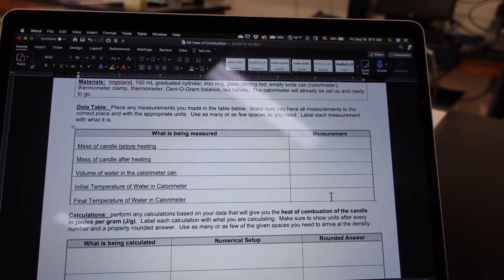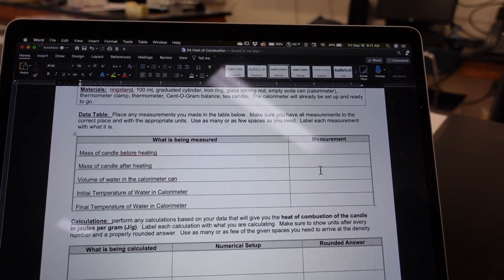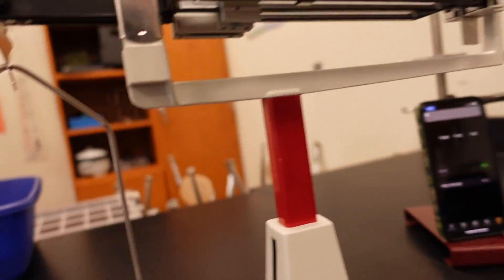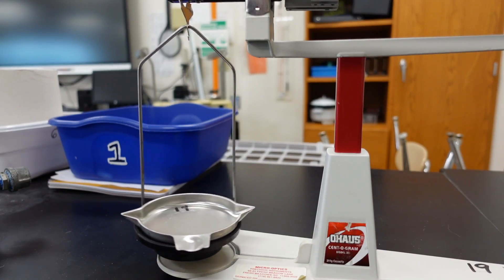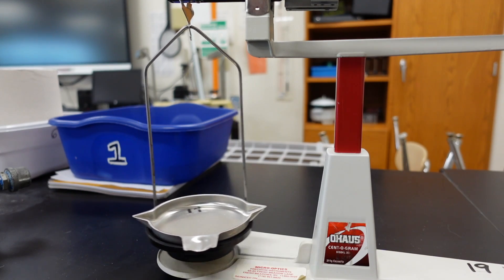Okay, and then you'll take that final temperature and place it where it says final temperature of water in the calorimeter. Now the only other piece of data we have to get is the mass of candle after heating. So let's take care of that so we don't spill any of our candle wax.